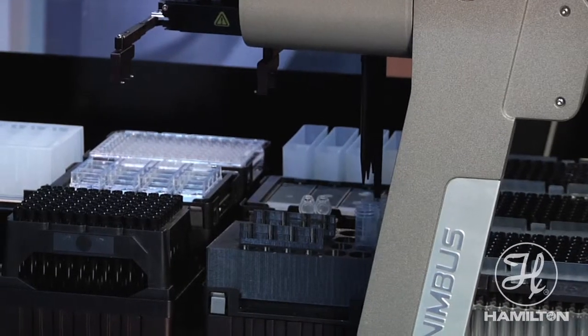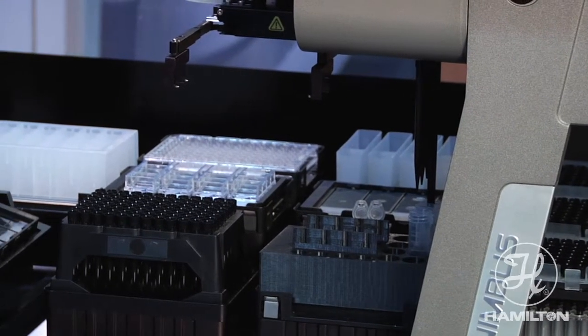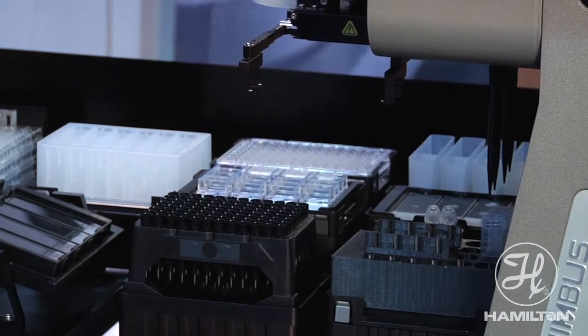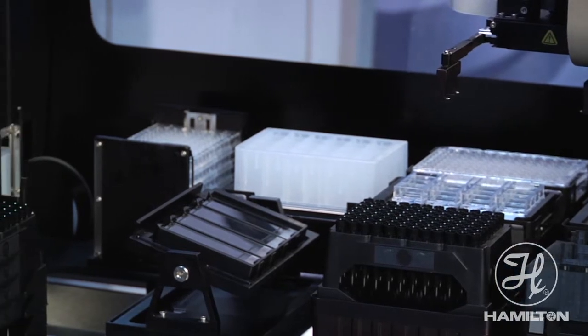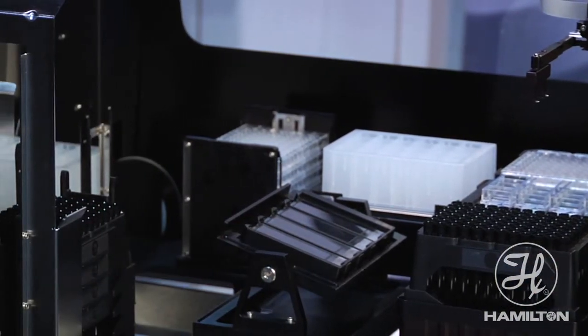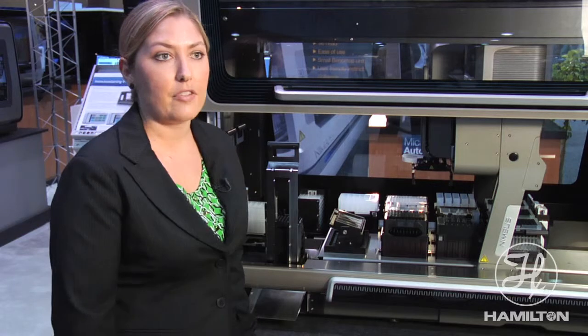We are able to handle 6-well, 24-well, and 96-well format plates or any SBS size plates, lab tech chamber slides, smear slides, as well as sample window type slides on this platform.